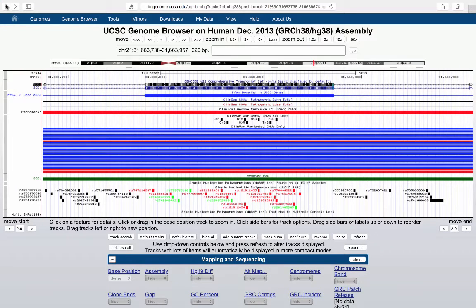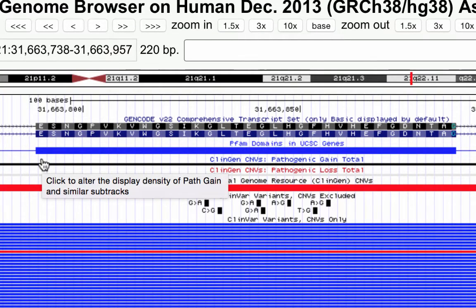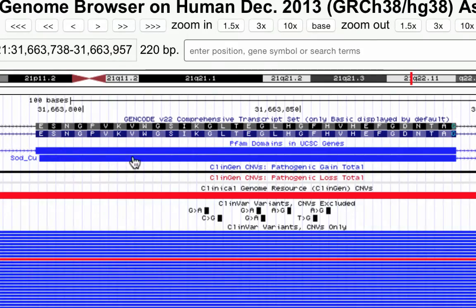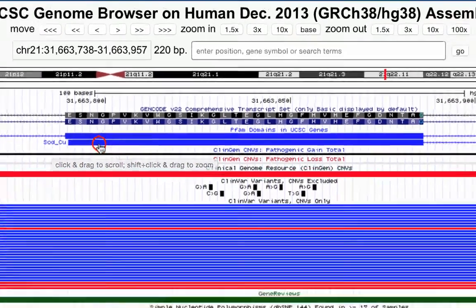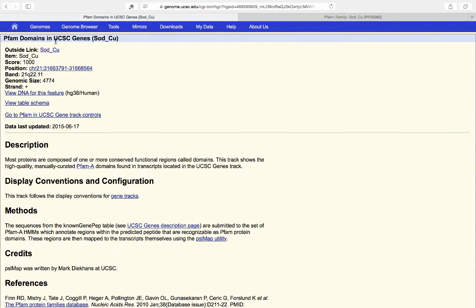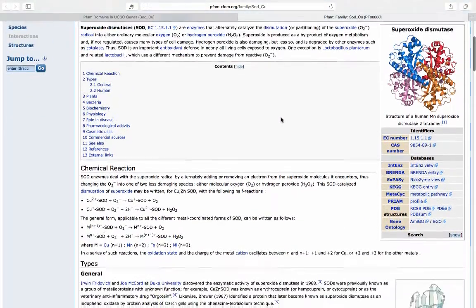I also wanted to mention the PFAM domains track for structural biologists or anyone interested in protein structure and function. PFAM domains are a database of known 3D structural domains in proteins. If you want to know what domains your gene contains, you can turn this on. In this case, we can click through and see that SOD1 contains the SOD copper binding domain. You can link out to this PFAM family and it will tell you it's a copper zinc superoxide dismutase and give you information about the 3D structure.